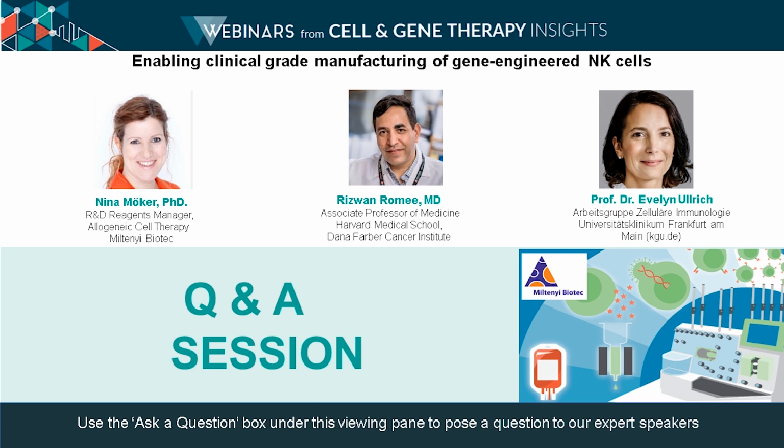We still have to take a close look at new constructs with regard to producibility, which MOI to use, the transduction efficiency, the vector copy number, the stability of the surface expression, and also in vitro and in vivo functionality, because if single chain variable fragments for the same target are introduced in the same CAR backbone, but the single chains themselves differ, this can have a completely different effect in vitro and in vivo.